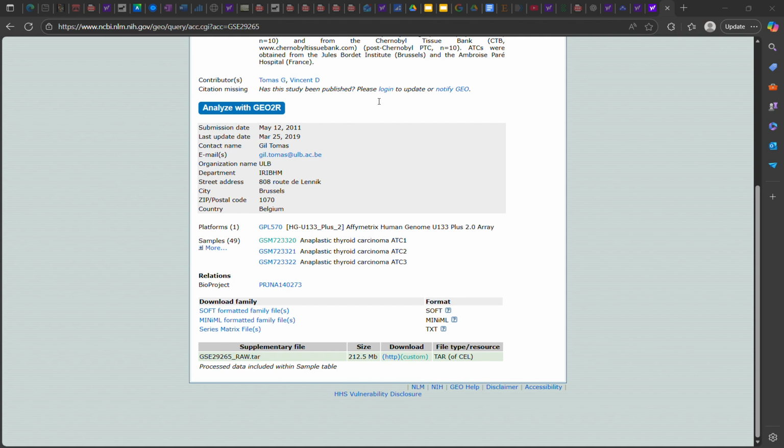And now you have your feature data with the 2 columns that you need, probe ID and gene symbol, all set. And you have the normalized expression with the probe ID in it. And so that shows you the gene expression of all of the genes. So you've got pretty much everything you need to do some analysis and research. And that's all you need to do. The end.